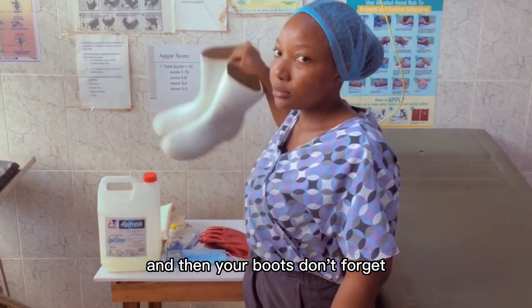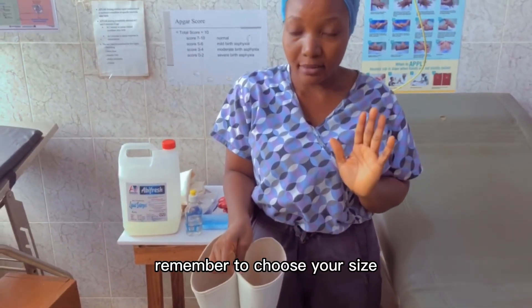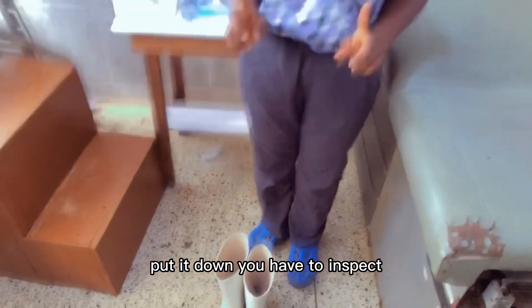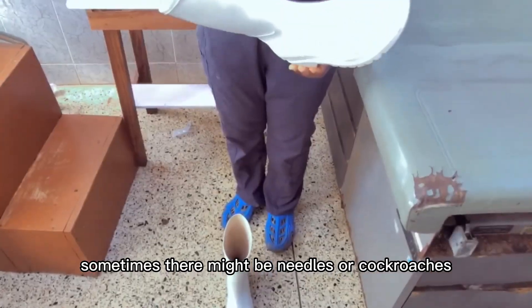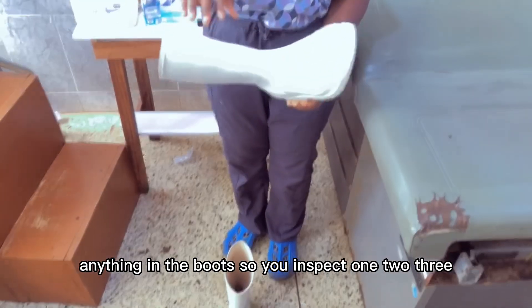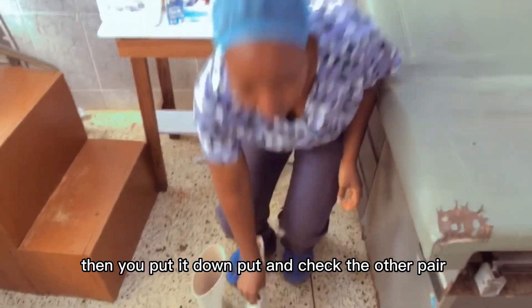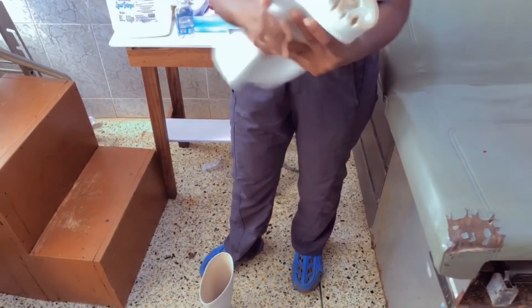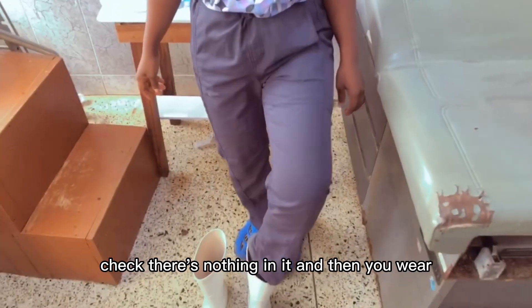And then your boots — don't forget. Remember to choose your size. Put it down and inspect. Sometimes there might be needles or cockroaches, anything in the boots, so you inspect: one, two, three. Then you put it down, put the other one on. Check — there's nothing in it. And then you wear.